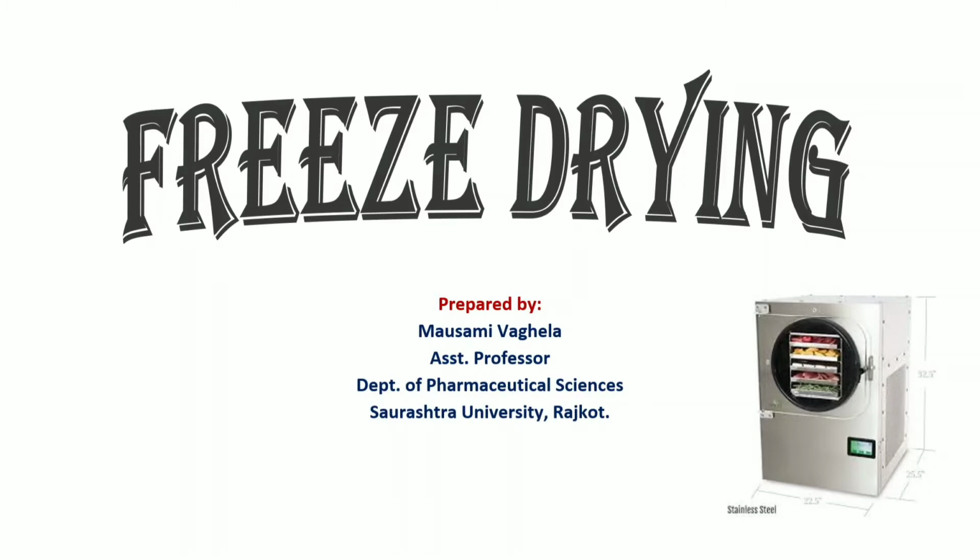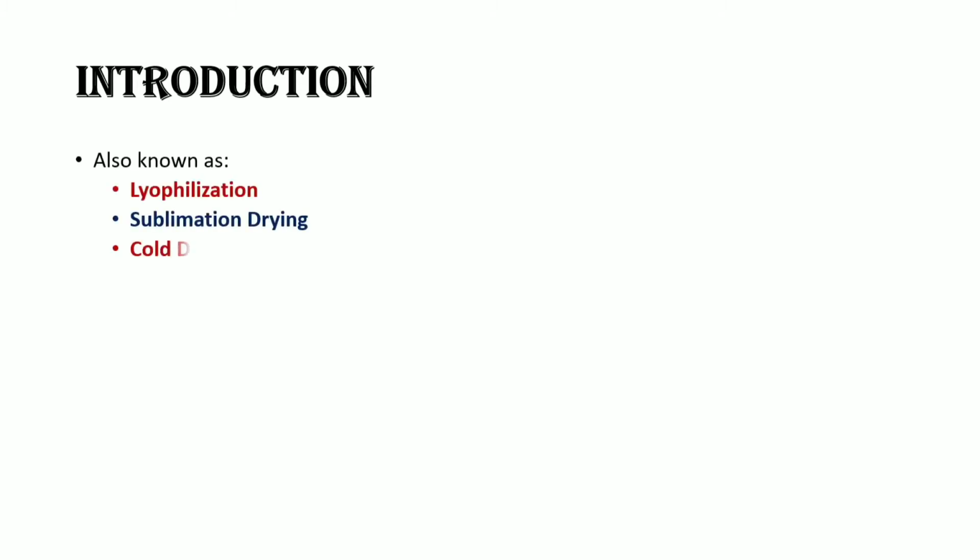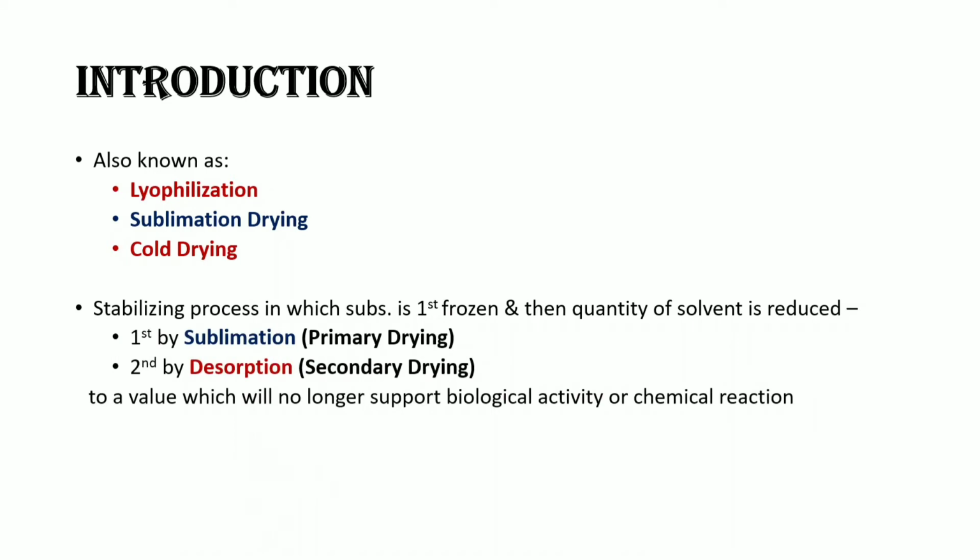Hello everyone. Today we are going to learn about freeze drying. Freeze drying is also called lyophilization, sublimation drying, and cold drying. This is a stabilizing process in which a substance is first frozen and then the quantity of solvent is reduced.